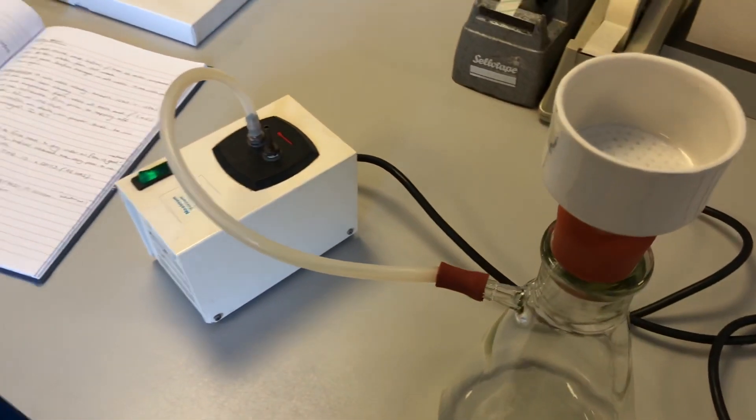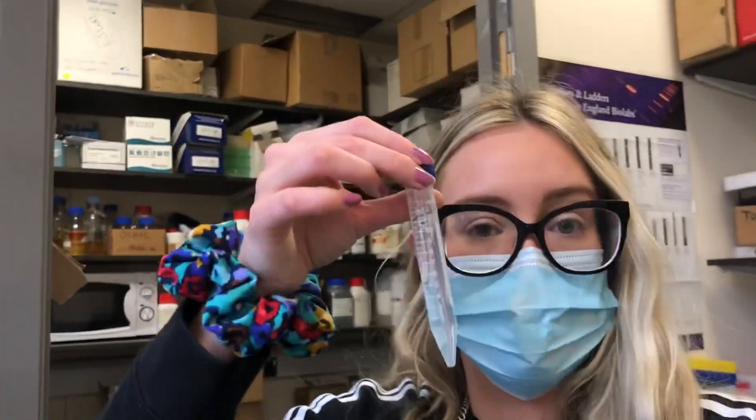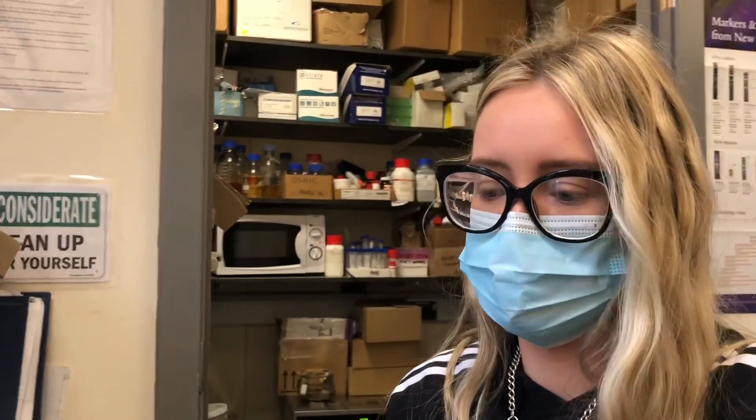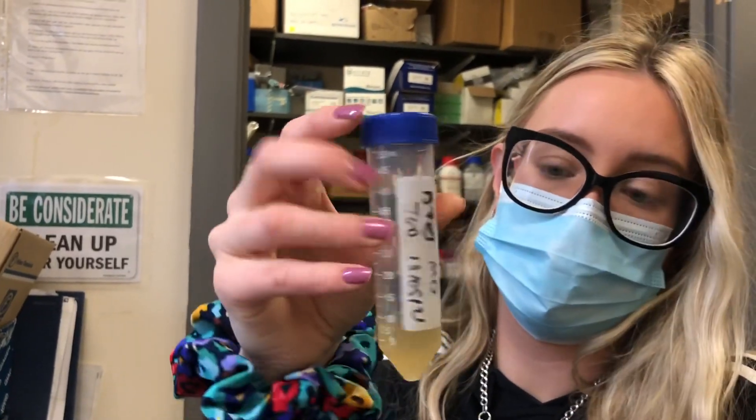I've also tried some things - usually I grow them in a 15 ml falcon tube, but this time I'm growing them in 50 ml. I learned that you should have a good surface to volume ratio. Bear in mind, I'm not a microbiologist, so I'm learning a lot on the job while trying to develop this assay. But I've been in contact with a microbiologist who's helping me out, and she said it's better to grow them in a small volume in a bigger tube, and it looks like they really like it.